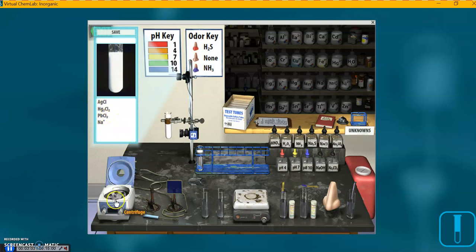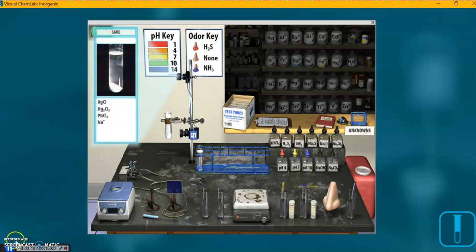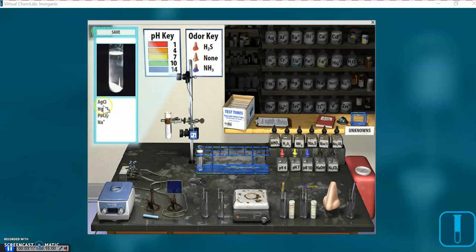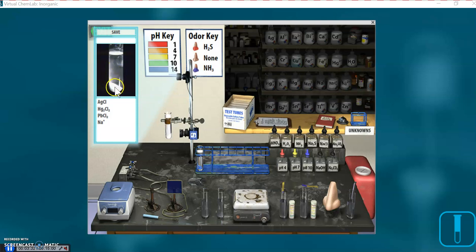We can also spin it. Centrifuge button, and look what happens here again. Spins down to the bottom. The precipitate is at the bottom, and we have a clear solution above. This is a known solution, so everything shows up here in the window, what's in there. But if this were an unknown solution, we wouldn't see this.